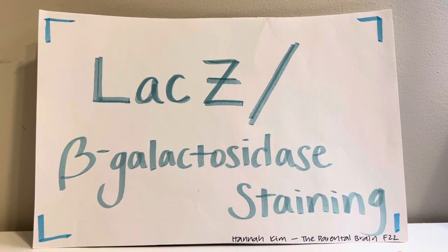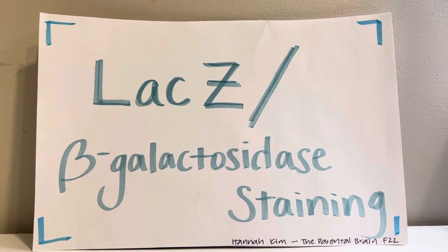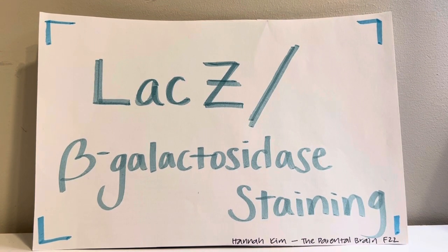Hi everyone! Today we're going to be going over a really important lab technique that's called LacZ or beta-galactosidase staining.